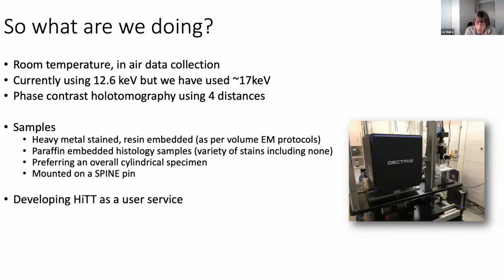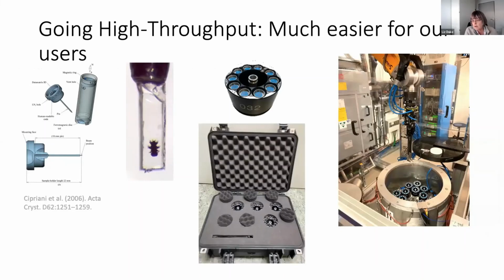And what we're able to use is the spine pin that allows us to then interface with the robot system so that we can then get through large quantities of samples. And so this just highlights the fact that we are using the robot, and any crystallographers or people familiar with crystallography will recognize the pucks and the pins.